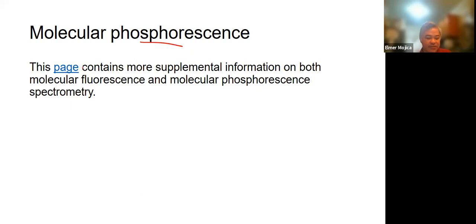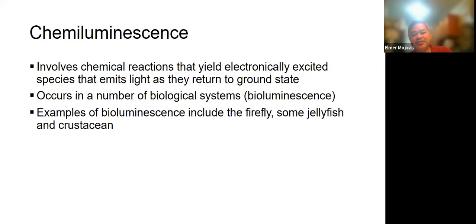Supplemental information. Now, the next thing that we're going to do is chemiluminescence. The one that we discussed so far is just luminescence. At the beginning, ano yung sabi natin sa luminescence? It's just the emission of photons from electronically excited states.